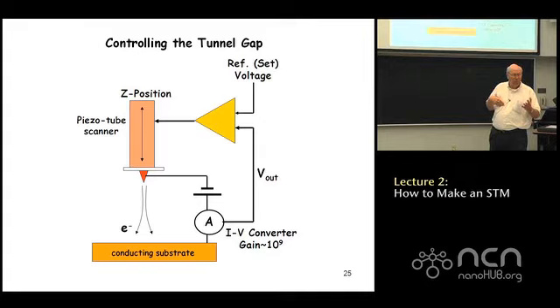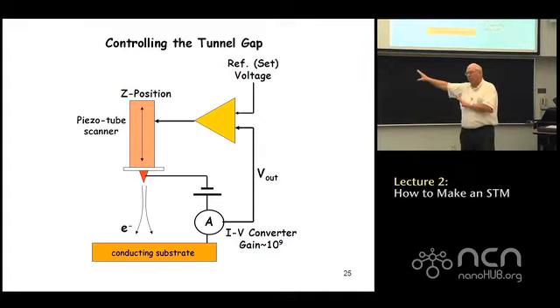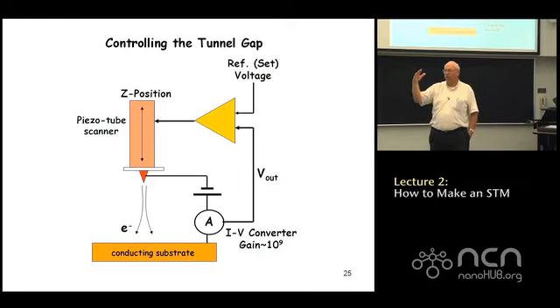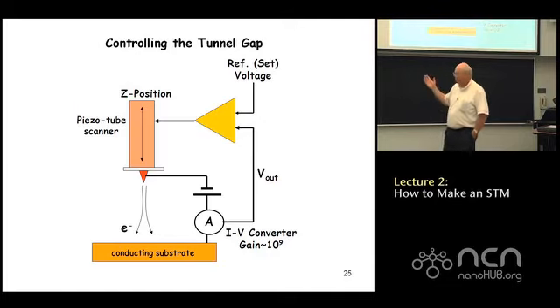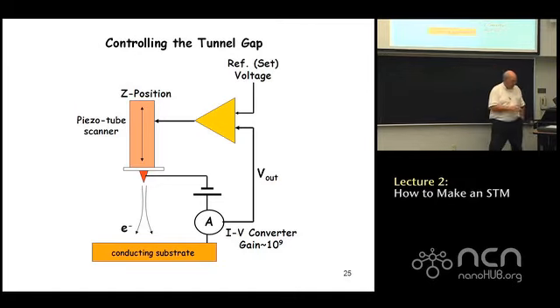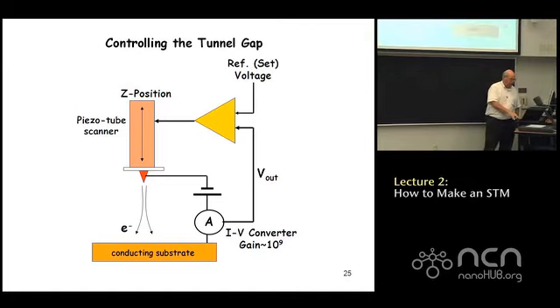Every scanning tunneling microscope has this embedded in it somewhere. The trick is to make the feedback circuit as fast and accurate as possible, so that if there's a sudden change in tunnel current, you accurately adjust the tip to compensate for that change. The same thing happens in AFM, except there we monitor deflections of cantilevers and need a slightly different feedback circuit, but it's the same principle.